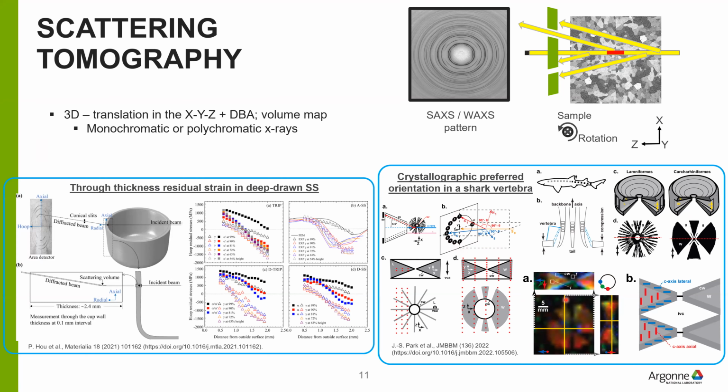If you look at a particular peak, in this case the C-axis, which is the stiff direction of the material that constitutes this structure, you see that depending on where you are on this bone structure, it's more prevalent to have grains with the C-axis aligned with the detector pointed in the horizontal direction, versus others in the interior of this carcharhiniform vertebrate structure here.